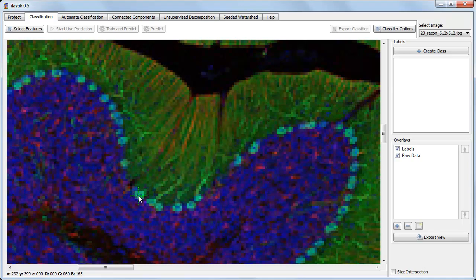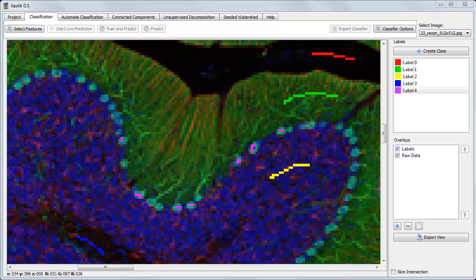But since you've already seen how to do that in the introduction videos, let's save time and skip ahead. Now that we've manually assigned a few pixels to each label, we'd like to automatically label all the other pixels in the image.